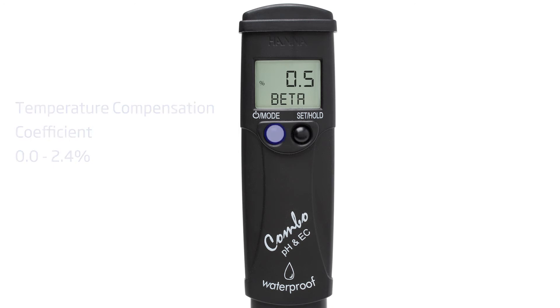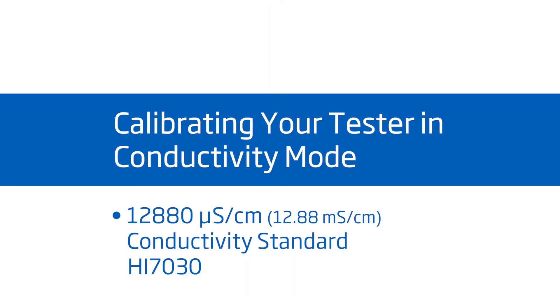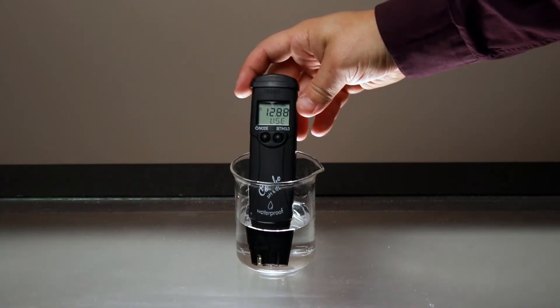Finally, pressing MODE again allows us to return to measurement mode. We also recommend calibrating EC using our conductivity standards. Pressing and holding MODE from EC or TDS mode will access conductivity calibration. You can use either 12.88 millisiemens HI7030 or 6.44 parts per thousand HI70038. To calibrate, rinse the tester with distilled or deionized water and place the tester in your desired EC standard. After the reading is stable, the tester will accept the calibration point and return to measurement mode.